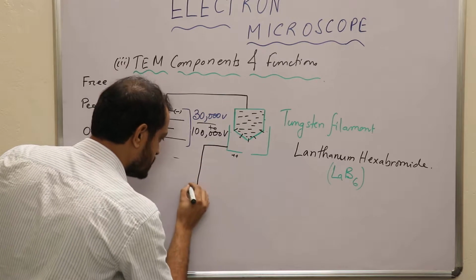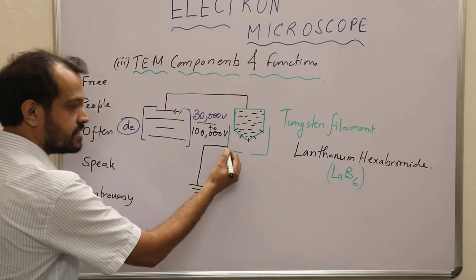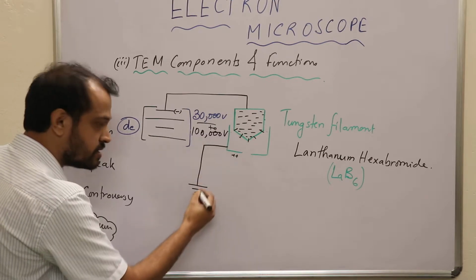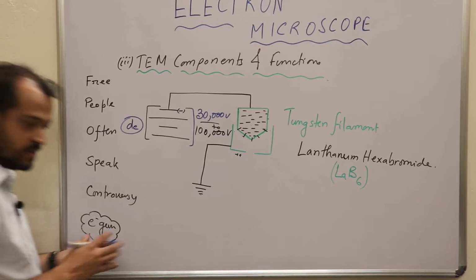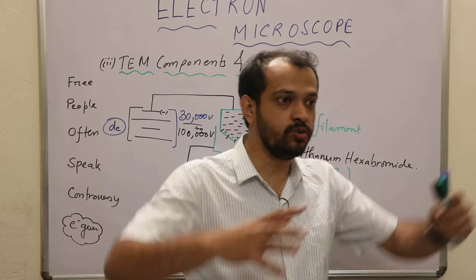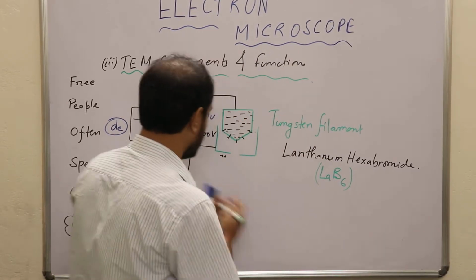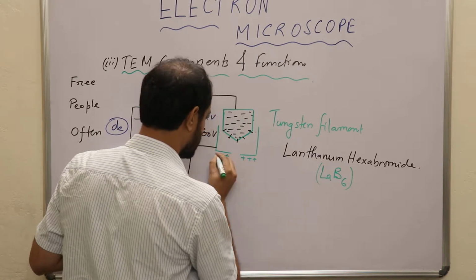To prevent this, they connected the casket, the iron casket, with what? Ground. Okay? What is the meaning of the term ground? Ground is nothing but a huge field of positivity. That means now it is positive, right?